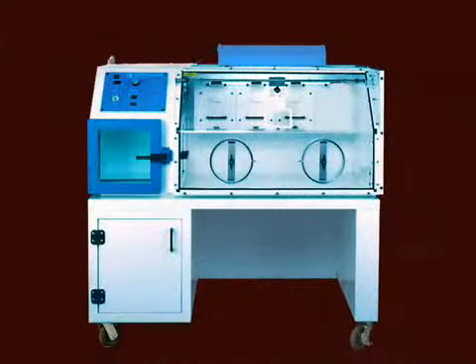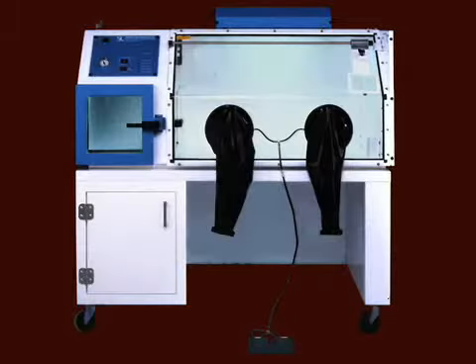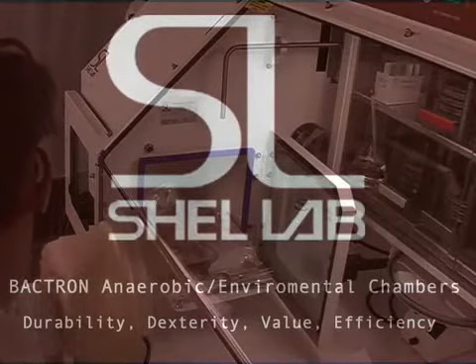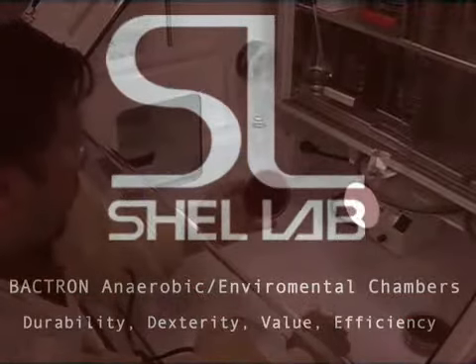Also available in the Bactron series is the Bactron 1, 2, 4, and 10, ranging in capacity from 100 to 900 plates. Shell Lab offers a variety of Bactron chamber models to meet any need or fit any situation.